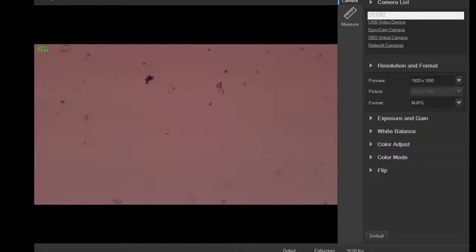This is the screensaver After Dark forgot to include. So that's pretty cool. Just random, pulling stuff out of the fridge. This one should also be interesting, and it is still alive. It's a leaf off of a celery stalk, basically the part most people don't eat.